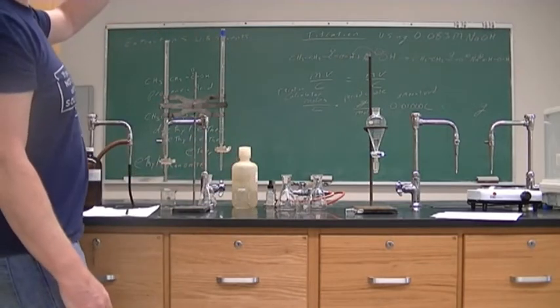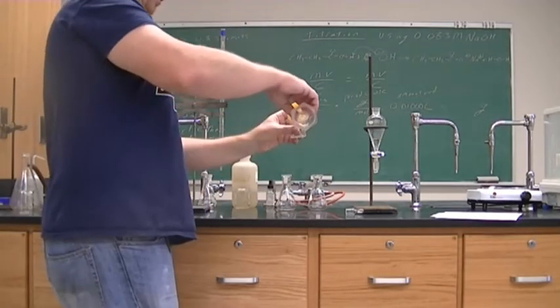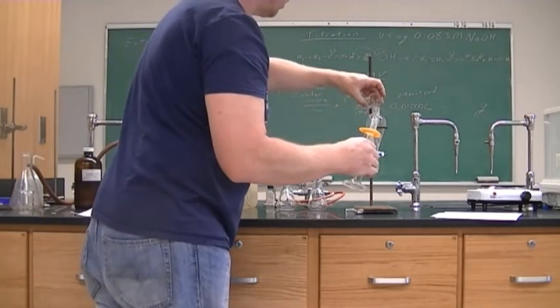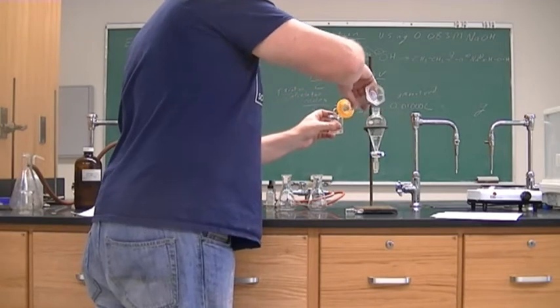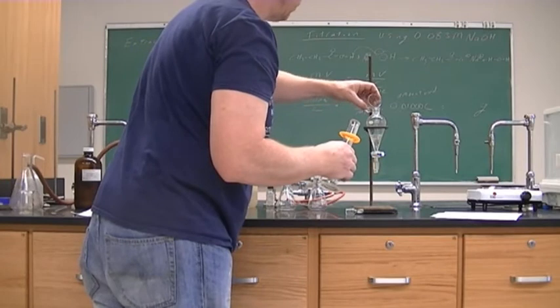All right, and so we have 15 mils that we will, to make sure all of our 10 mils comes out of here, put in by adding it to this beaker and then pouring it in.